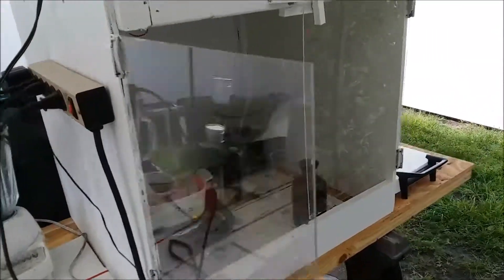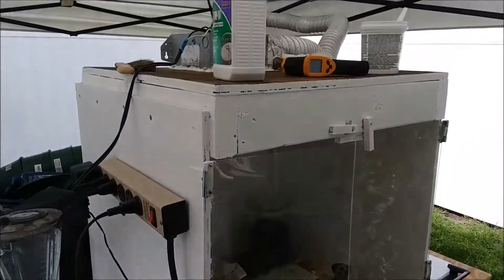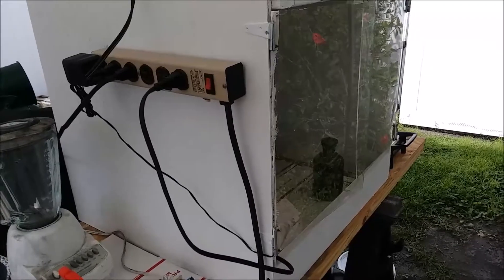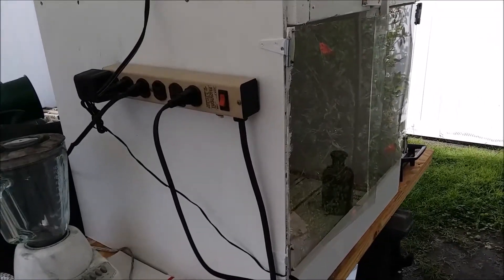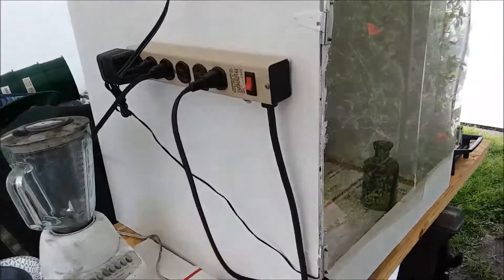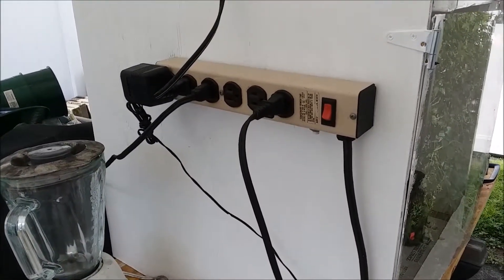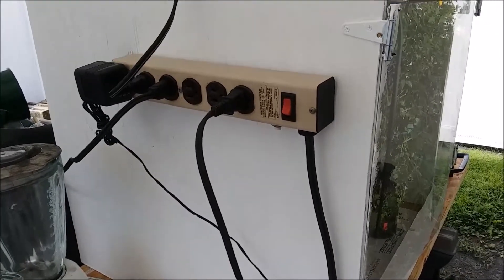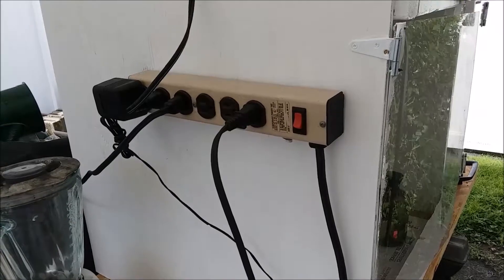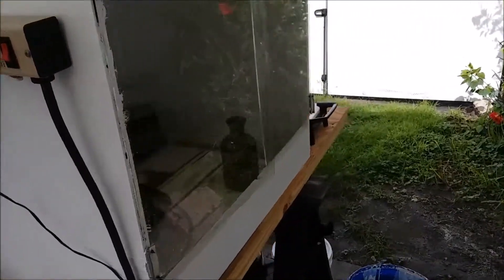It's time for a brutally honest assessment of my new fume hood. The good: it works, it keeps the fumes out of my face — it works pretty darn well for that. It's got a few issues. I keep popping the circuit breaker on this outlet strip; it's an old outlet strip and I think the circuit breaker is on its way out, so I'll probably replace it. That's pretty minor.